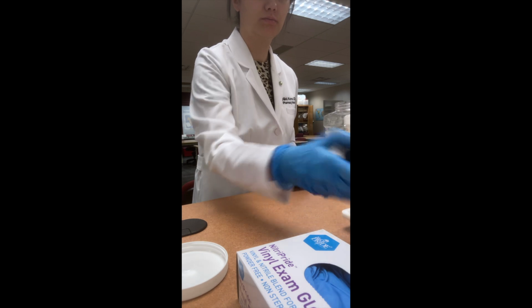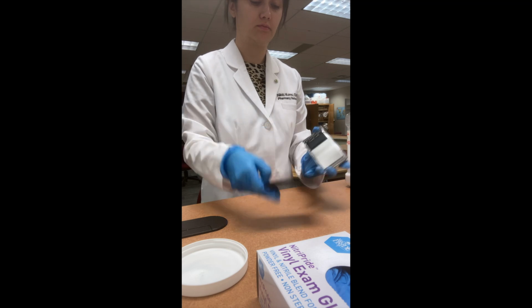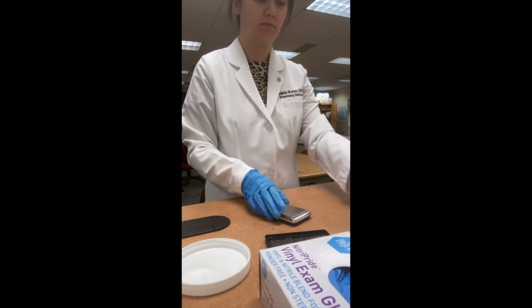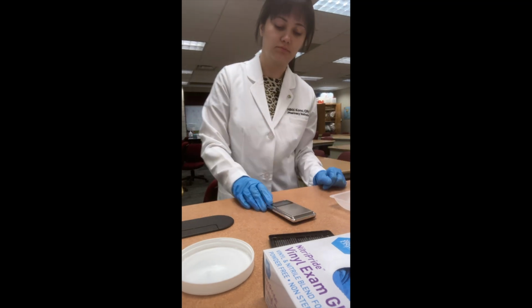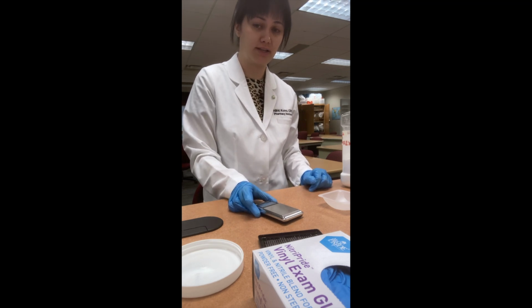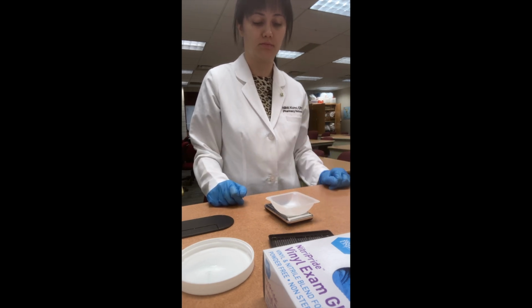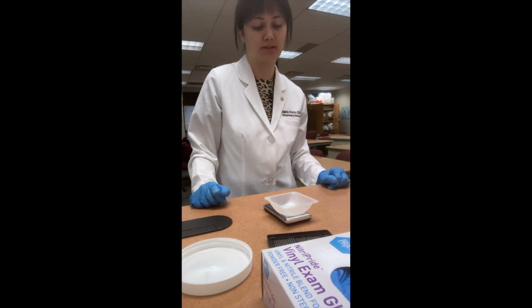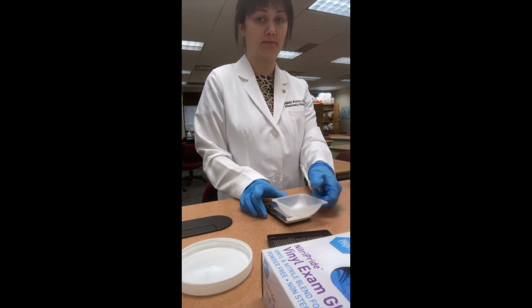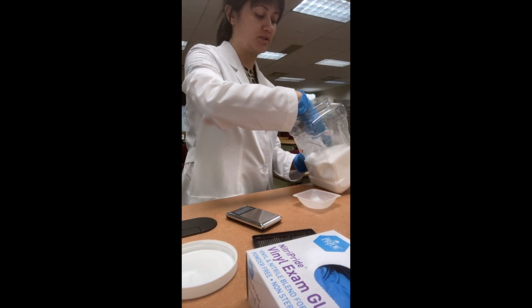So here are our scales, and here are our weigh boats. Weigh boats are usually used to measure powders. Turn on my scale, have it set to 0. I'm going to put the weigh boat on it. Right now it says 2.37 grams. I'm going to tare that to make it say 0. Now I can take my weigh boat off and add. First I'm going to do the salt. You can do either one first.